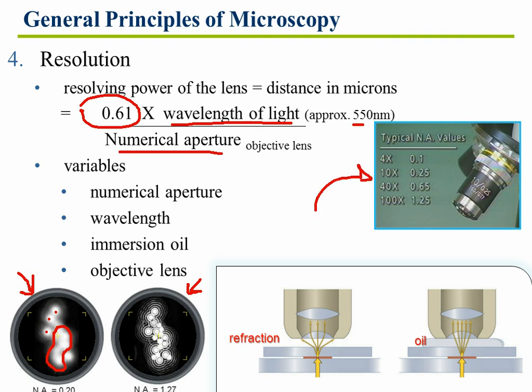Now, notice over here. Okay, so we need to talk about numerical aperture. It's a quality of the lens. It's based on how finely ground the quality of the lens is. Has to do with the light aperture, the cone of light going through the lens. So, on your microscope you see there's an objective lens right there, and the first number, 10, is magnification, and the second number behind it is 0.25. That's numerical aperture. This happens to be a 10x lens right there. Now if we were looking at something on this scope and switched to 40x, look what happens. Your magnification goes up, so your object will be bigger. But remember, that's magnification.